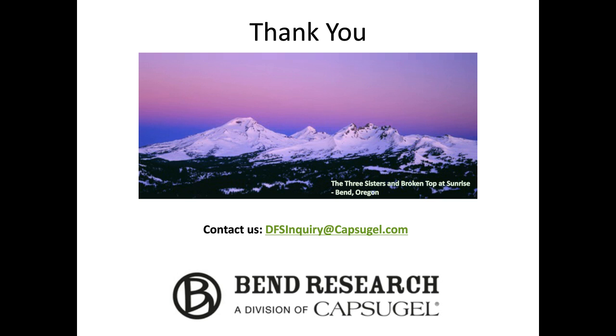Thank you. And the next question we have, did you look at other liquid handlers besides Gilson? Oh yeah, so we did. We explored many different options, and we found Gilson to be the most reliable.